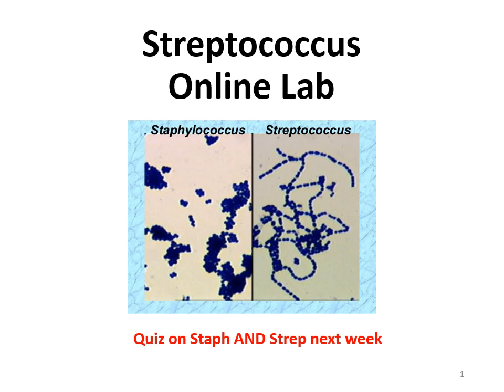Okay, so welcome to this week's online lab, which is focusing on Streptococcus. I actually consider this a continuation of last week's lab because Staphylococcus and Streptococcus go together very well, and you have to be able to ask yourself, when encountering an infection of either of these types, how do I distinguish them? How do I first distinguish between Staph and Strep? How do I then figure out exactly which species within either of these genuses is currently the problem?